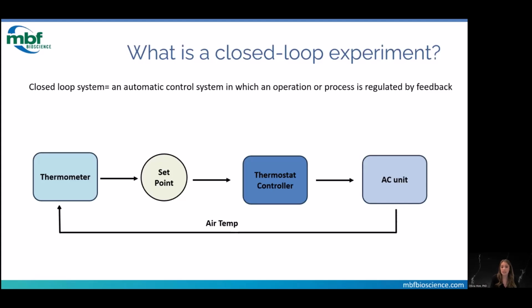In order to adapt this for neuroscience, we can rename these terms with more general words. In neuroscience, you have some kind of data stream, some measure that you're monitoring in real time, and then some threshold or criterion that that data must meet in order to execute an action. Then you have a controller that is tracking all this information and deciding when to actually trigger hardware output or not. And then you have an actuator, which is your hardware that's actually acting on the system.